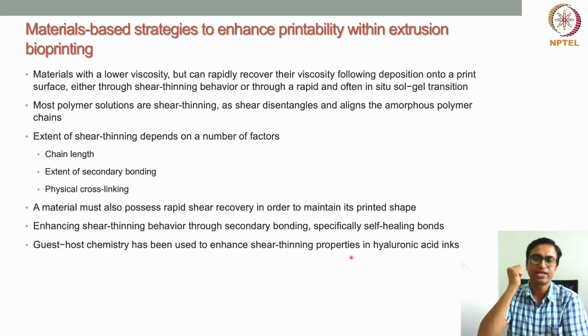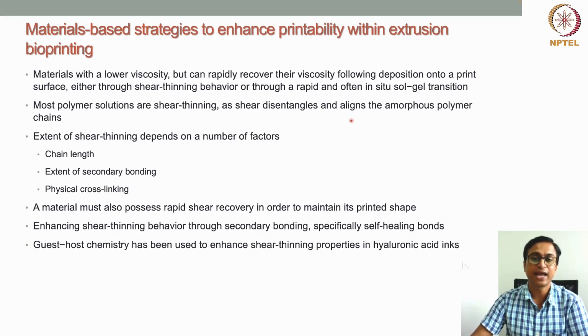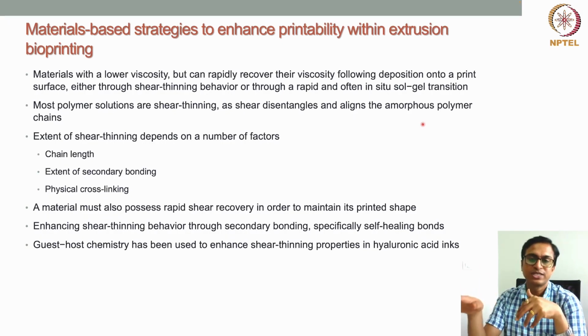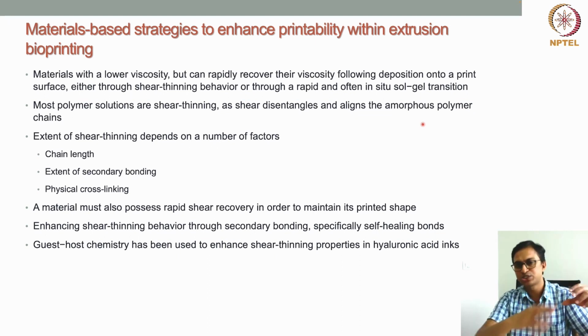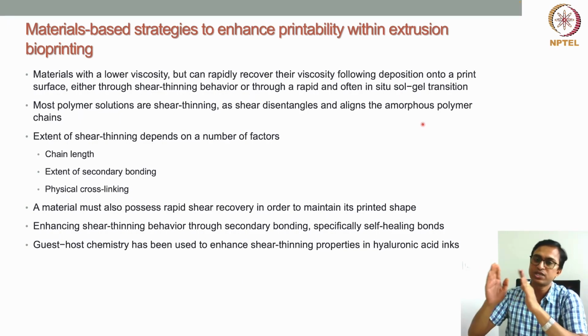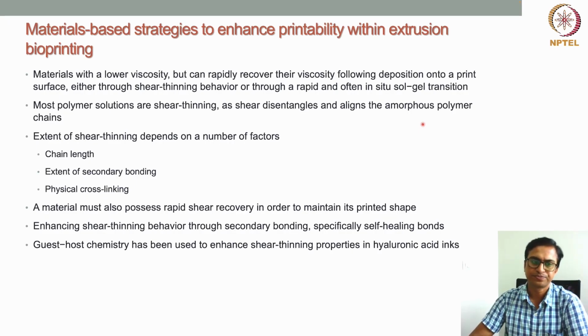But as soon as we apply shear, the shear disentangles the material and aligns the polymer chains towards the extruding direction. That means the shear force helps the material disentangle and align the polymer chains, so the material can easily pass through the nozzle, and in this way the viscosity comes down.